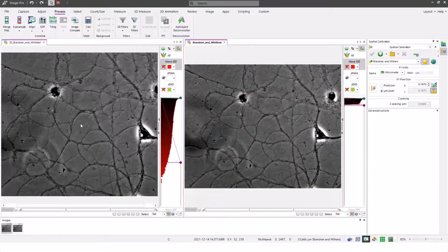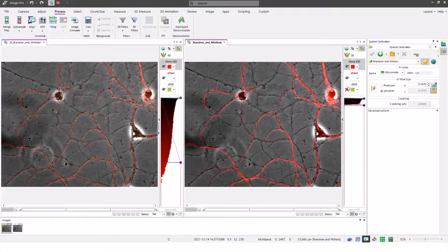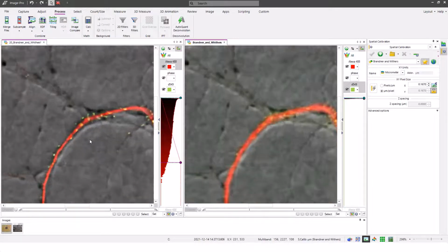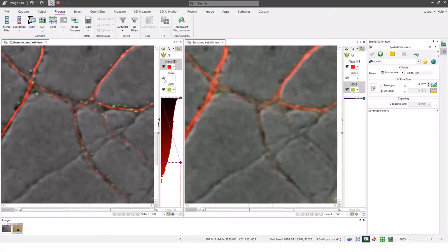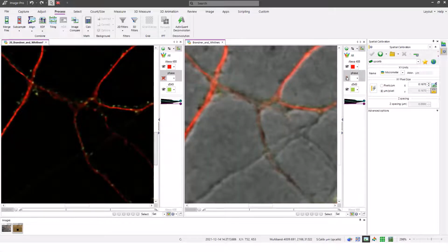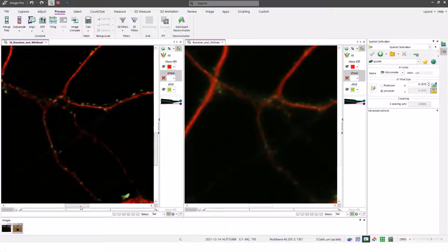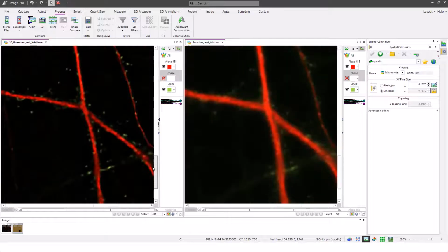So you can see clearly that the phase contrast image has been passed through unprocessed. If we look at the fluorescence channels, they're much crisper on the deconvolved image. We can see the dendritic spines really clearly in the deconvolved image. Let's hide the phase channel from each image set and do the comparison. I think it looks really clear how much sharper the deconvolved image looks.